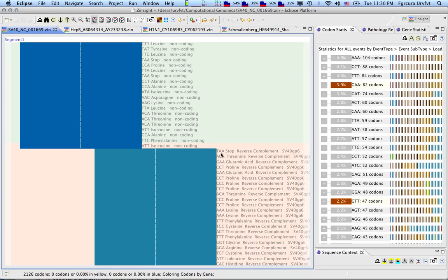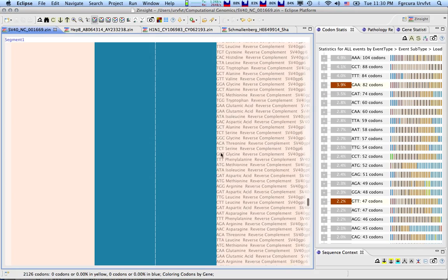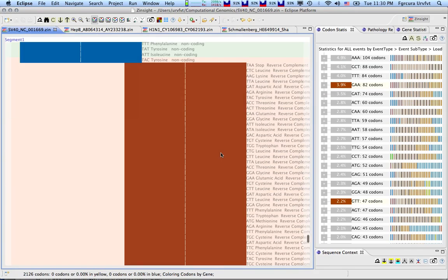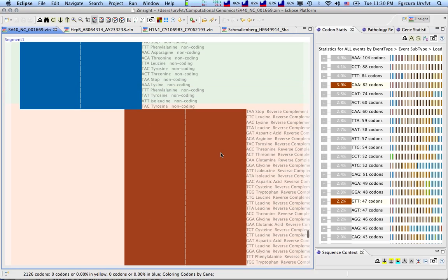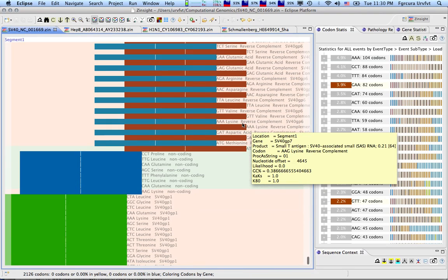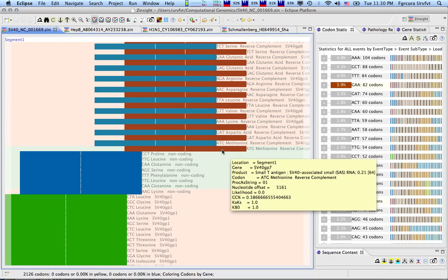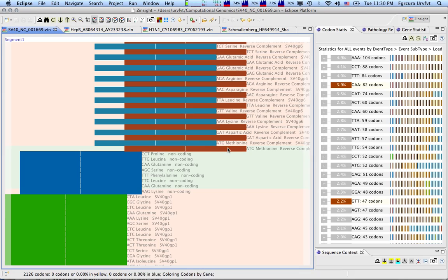Here's the stop codon, and if we go to the bottom of the GP6 gene, we'll see, so actually now we're in intron region, so here's the stop for another backward sense gene, and if we go to the bottom, now they're overlaid, and now we can see here's the start for GP6, and here's the start for the other. So it has genes that go positive and negative in this circular genome.